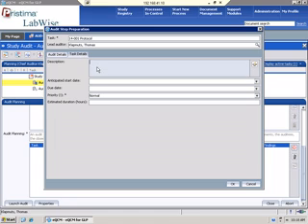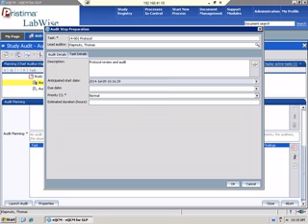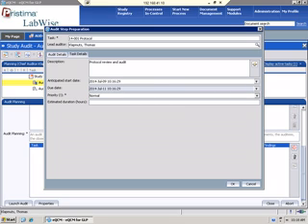The next is going to your task details. So here you can put in, again, a description of the task, just protocol review and audit. Anticipated start date. So if you pick, I'm going to start the protocol audit, say yesterday, and it's due by tomorrow, so it's giving the auditor 2 days. You can have a priority of it. Is it a high priority, low priority, or normal? And then how long do you think it's going to take?